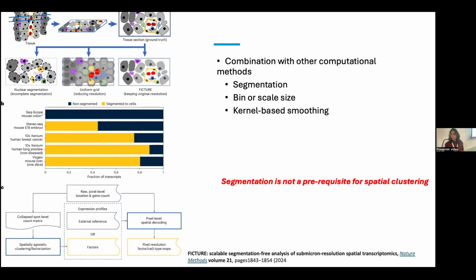So some of the issues that come with segmentation. Sometimes the code, everything looks fine, but there are some who have experienced that the nature of the cell types that populate their tissues actually results in a lot of bins that are dropped off after segmentation. Do you want that? What if you actually want to keep regions that are acellular as well? What if your primary purpose is not cell-cell communication or something that's granular, but you want to see the trajectory of changes across a spatial domain?